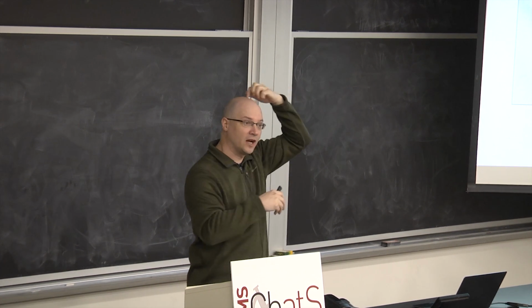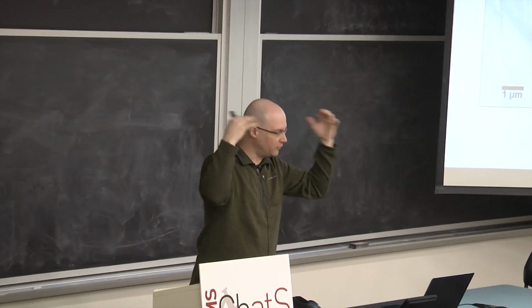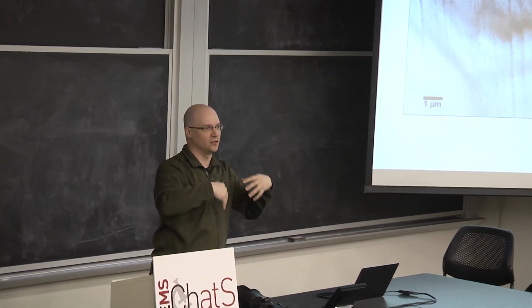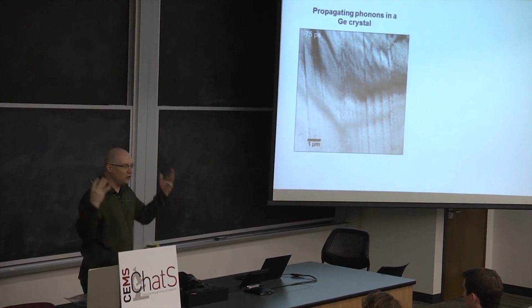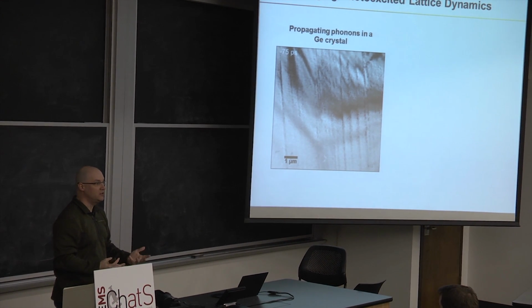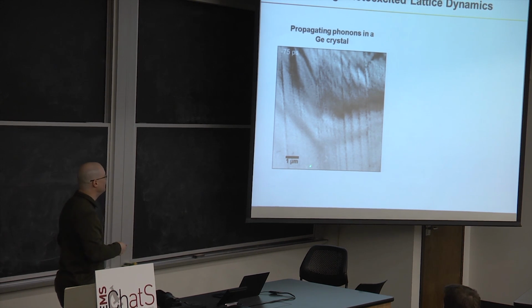And that is where it gets very interesting, right? Because now all of these processes, it's very hard to understand them because there's line dislocations, there's vacancies, there's interfaces, there's boundaries, there's all this stuff. So how could we possibly understand these processes? Image them. Let's go in and take a look, all right? So that's what we do.